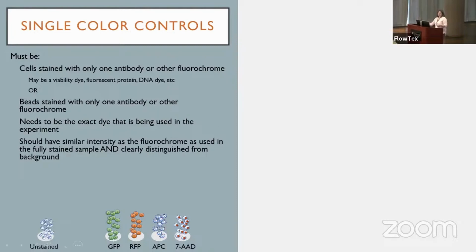So that's going to be the single color, the GFP, the RFP. And you also had better know what the background looks like, so autofluorescence that's coming out of that background, okay? So we can't just load the GFP all by itself. It's a small molecule. It's not going to trigger the instrument, right? So what we have to do is attach it to something. I don't care whether you attach it to cells or you could attach it to beads, but in either case, you have to have something that carries that through and it has its own background signal for autofluorescence. That background, it seems obvious, should match whatever's on the positive. Yes?